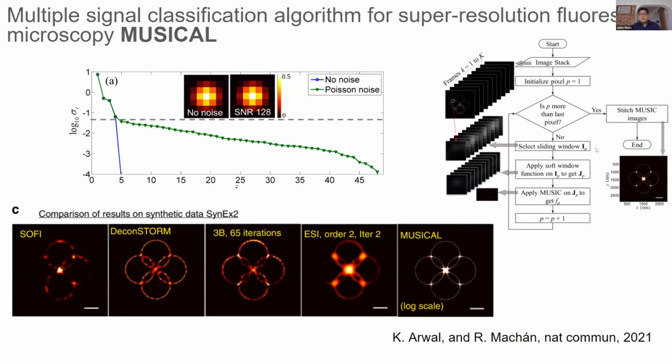You have some examples in here. They create synthetic data to benchmark the results against other kinds of results. For instance, you identify measure in here that I already mentioned, and you have something here that I already mentioned, and they benchmark it like this. You can see that, of course, with this display, MUSICAL is the one having the best results.